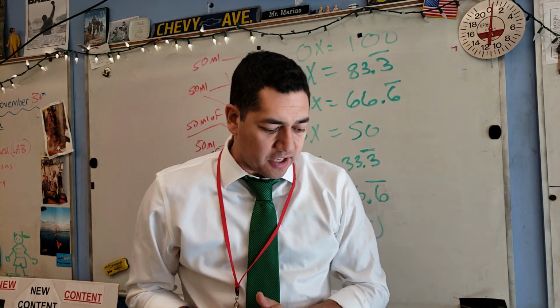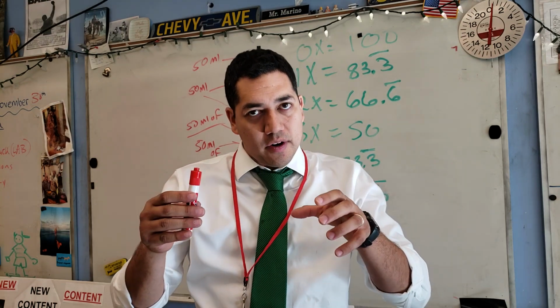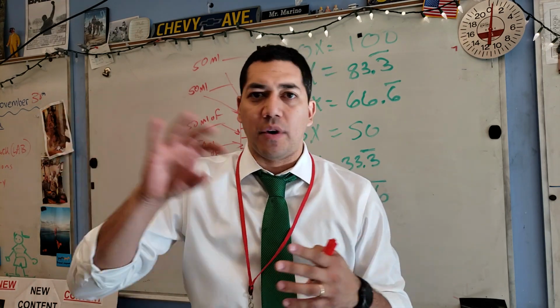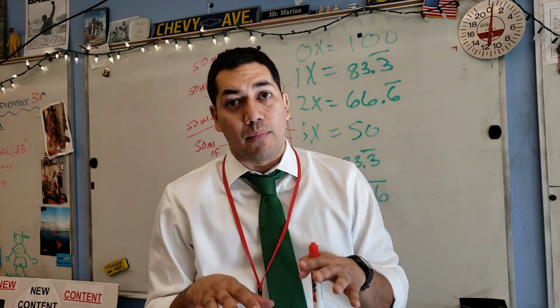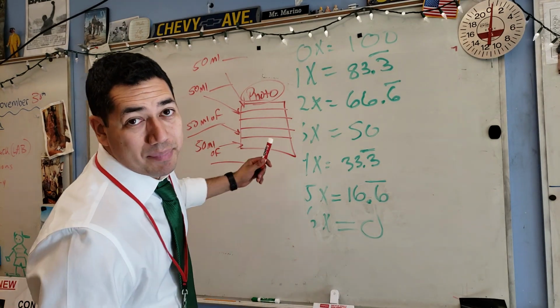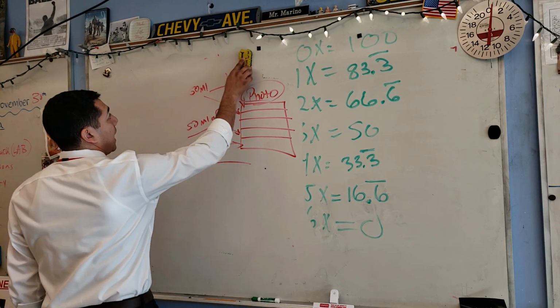Now, as you're pouring these into the glass beaker, use the graduated cylinder to pour carefully down the side of the wall. You don't want to just dump whatever liquid it is on top. Pour it slowly and carefully and let it dribble down the wall so that it can layer properly. Once that's done, take a picture and compare it to what you initially thought, and write that down somewhere.